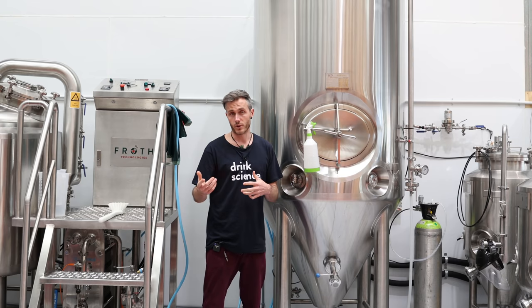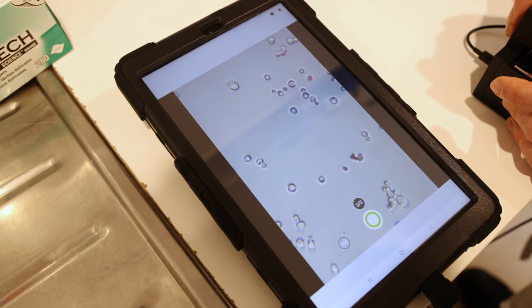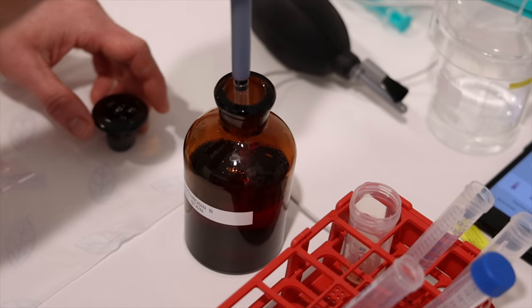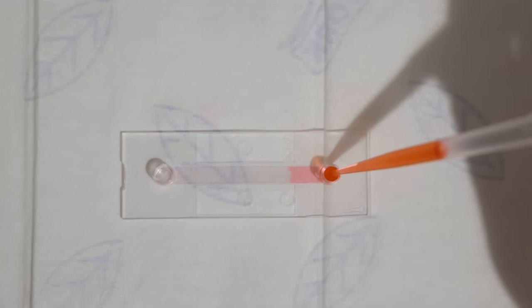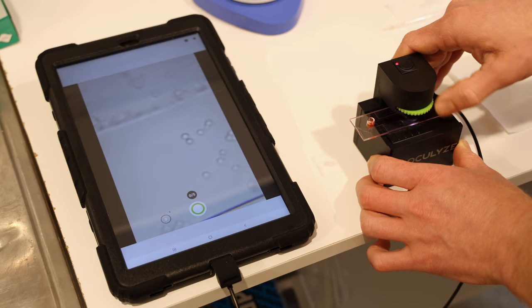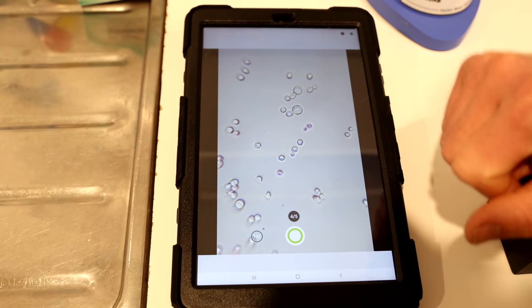On top of knowing what the yeast is doing, we also need to make sure there's no other unwanted organisms or contamination in there. The first aspect of this quality control process is a cell count. A cell count checks the viability of the yeast by measuring the ratio of live cells to dead cells. A sample is taken and homogenized, then serially diluted down to a density that's in the measurable range for their equipment. A cell stain is added to make the dead cells visually discernible from the live cells, and the final solution is added into a microscope slide where capillary action pulls the sample across to fill the chamber. This slide is loaded into a digital microscope hooked up to a tablet running software that does the cell counts for them. You can see the live ones are nice and clear, and then we've got a couple with light staining — those are likely dead cells, and the software recognizes that.